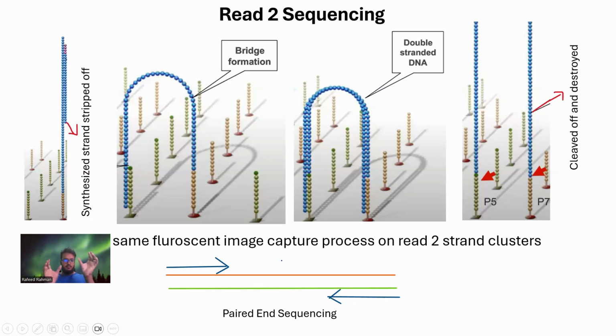Now if we map them to the reference genome, we have to do two checks. One is whether the forward and the reverse part are intact in a similar place. If that check is satisfied, then we can say that this is mapped to this particular position of the reference genome. So we now know with high confidence that this particular fragment is supposed to map maybe in chromosome 1, position 1000, I don't know.